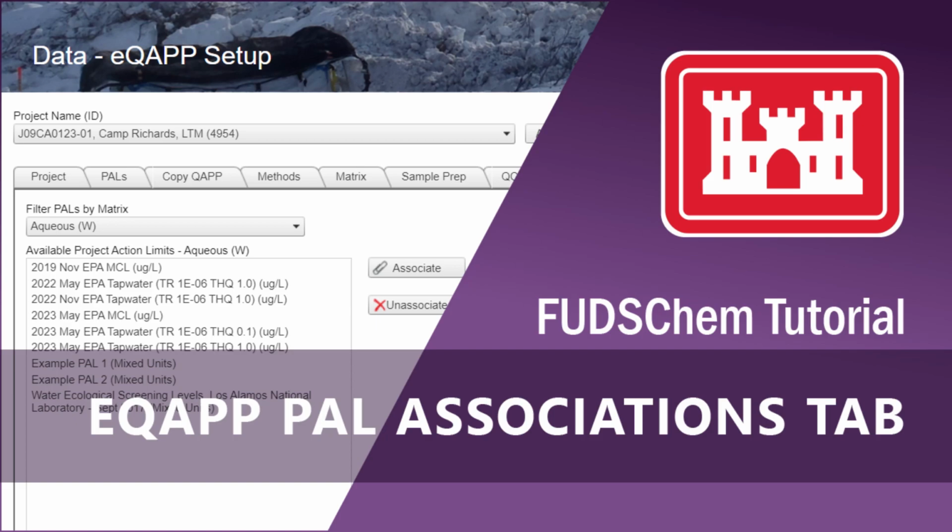This video will go over the eQAPP Setup tool, PAL Associations tab. The tab allows the project action limits that were entered for the project on the PALs tab to be associated with the methods for the project. Doing so automatically updates the PALs and Project Quantitation Limit Goals, PQGs, on the Analyte Limits tab, based on the rules that were established earlier in the eQAPP setup.